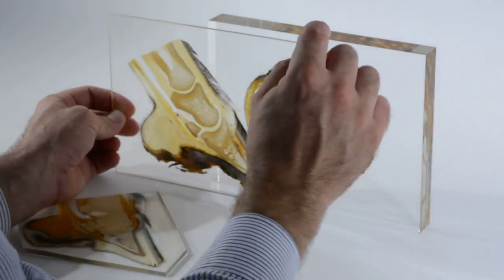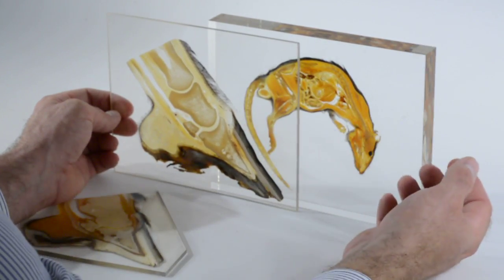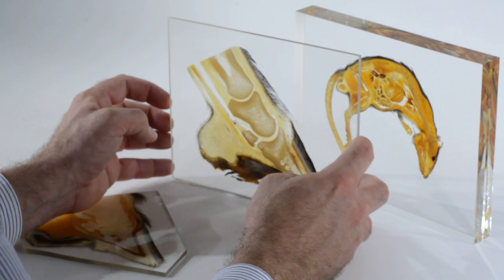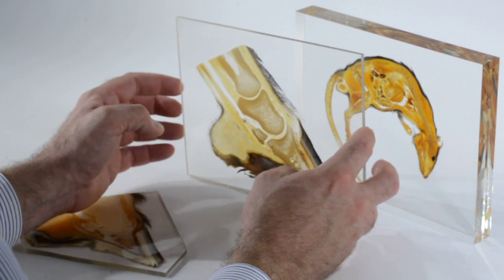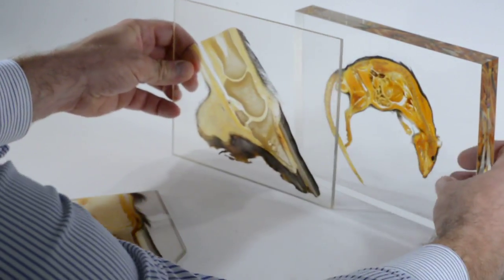Both are the same specimen inside. This one is mainly for exhibition. You can put it upright and place it somewhere, while this one is kept in a shelf or in a box or in a bag, and you take it out and use it for hands-on instruction, for example, with the students.